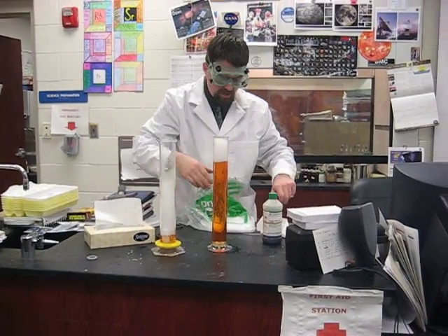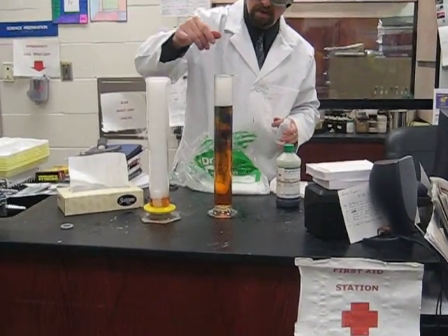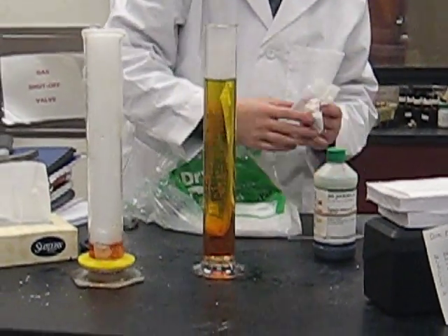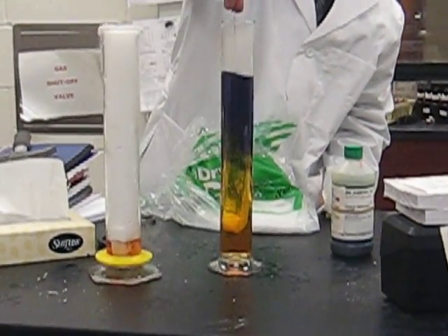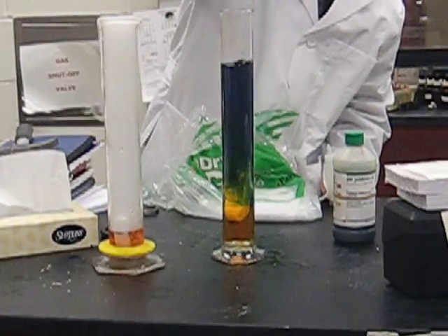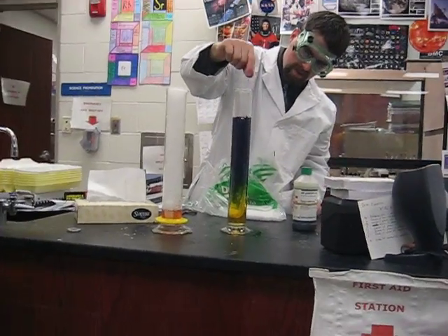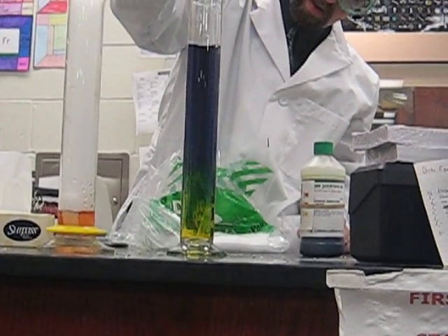I can reverse the process as well. If I add base back in there, we can reverse the process. Obviously didn't add enough — orange, green — didn't get quite enough into the basic range. I don't know if I have enough base to totally neutralize the acid back into base. I got it into the blue range, but I want to get it all the way into the purple.